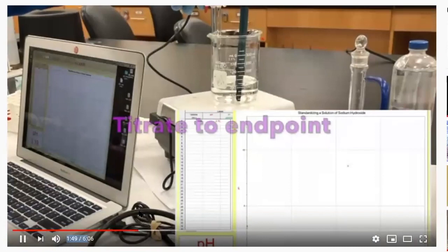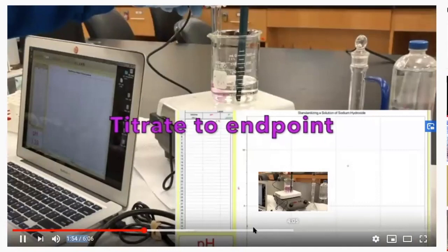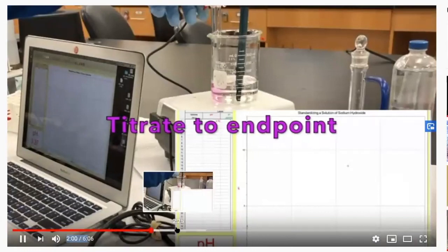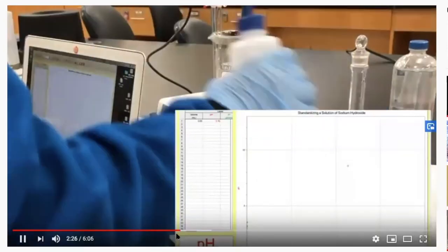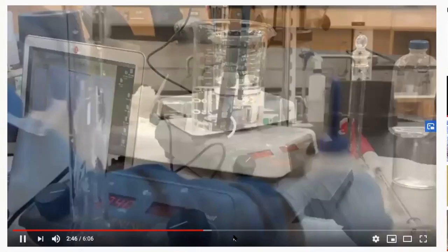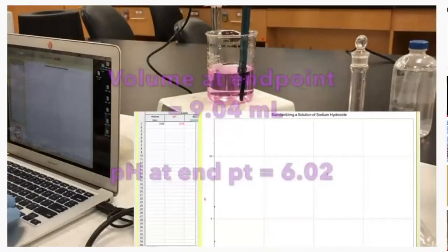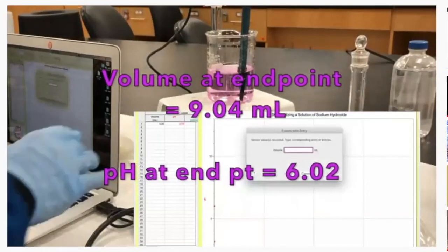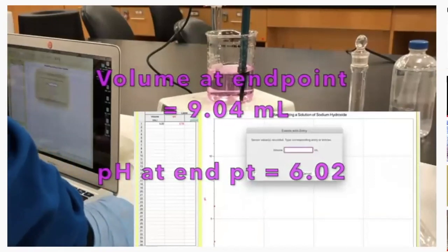The dot at initial, what the pH is, that's this right here. And then the dot at the equivalence point. So I titrate it to the equivalence point, and when this thing turns pink, I know I've reached the equivalence point. Here it is, pH at the equivalence point 6.02. But that pH is not relevant because that really doesn't give me much information.